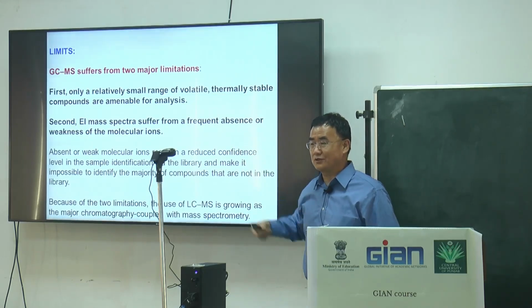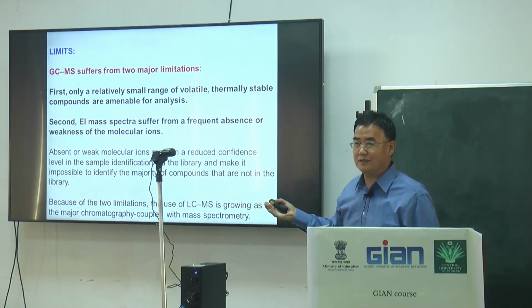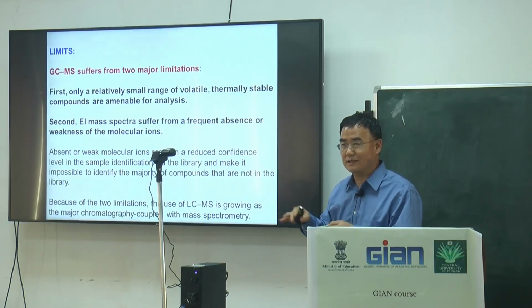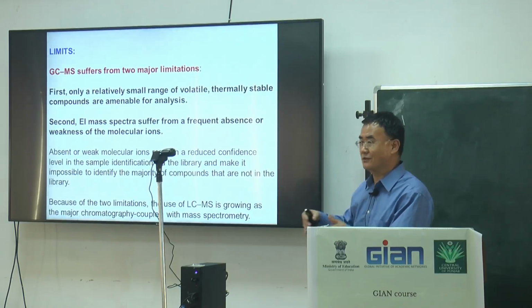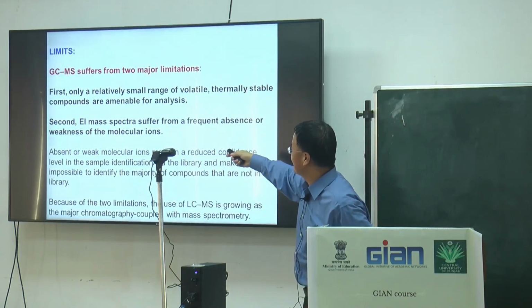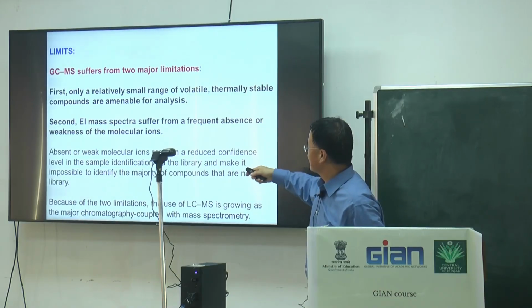For some compounds, we really couldn't evaporate them. Probably you just haven't found the proper method, such as methylation or others. However, those new methods are still under development.